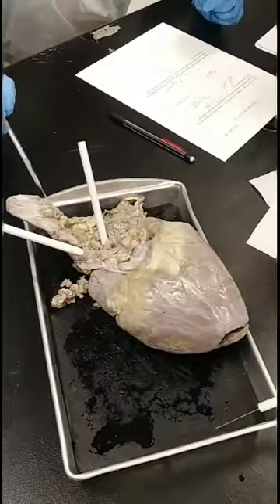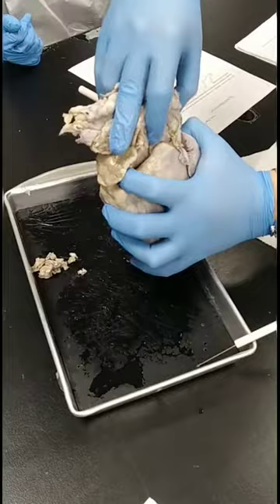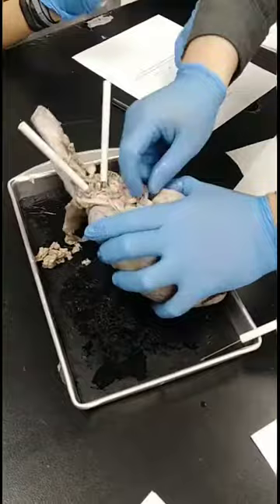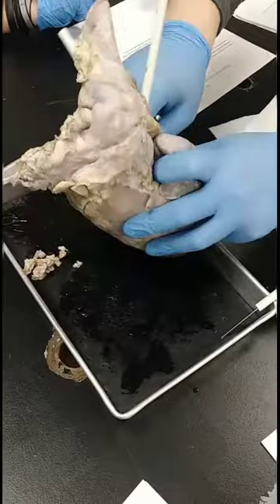It's asking about the vena cava, right? Okay. Here's what the vena cava is. They're both the veins. It's one big vein, but they take the blood back to the heart from the rest of the body, right?